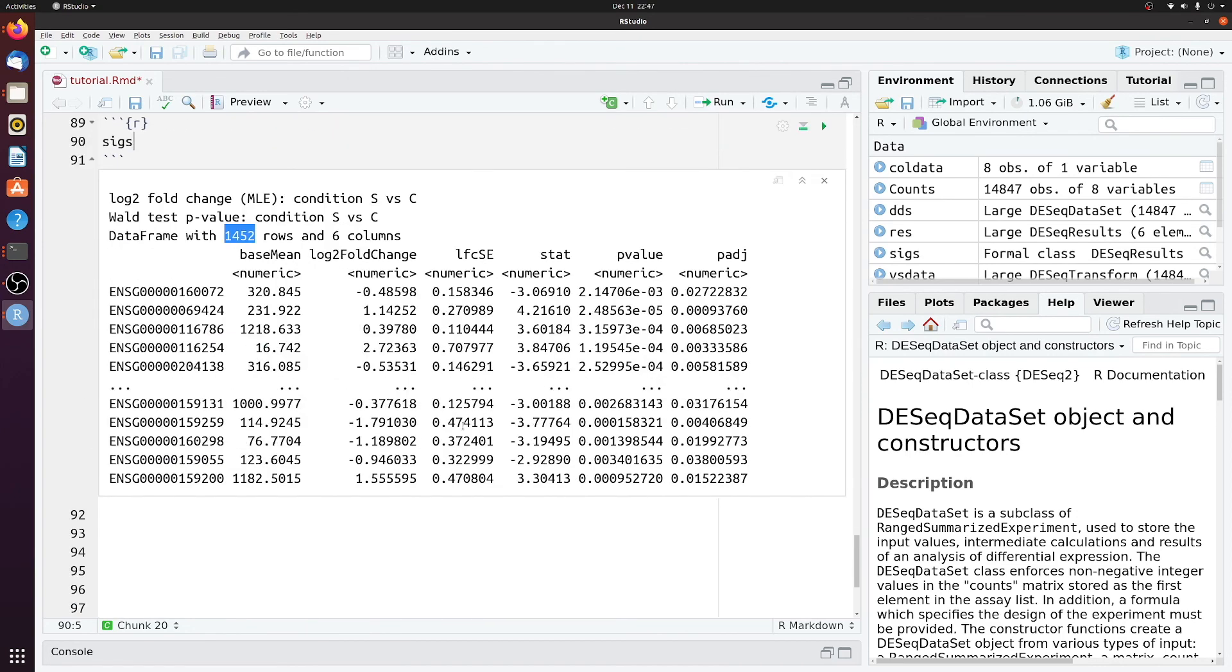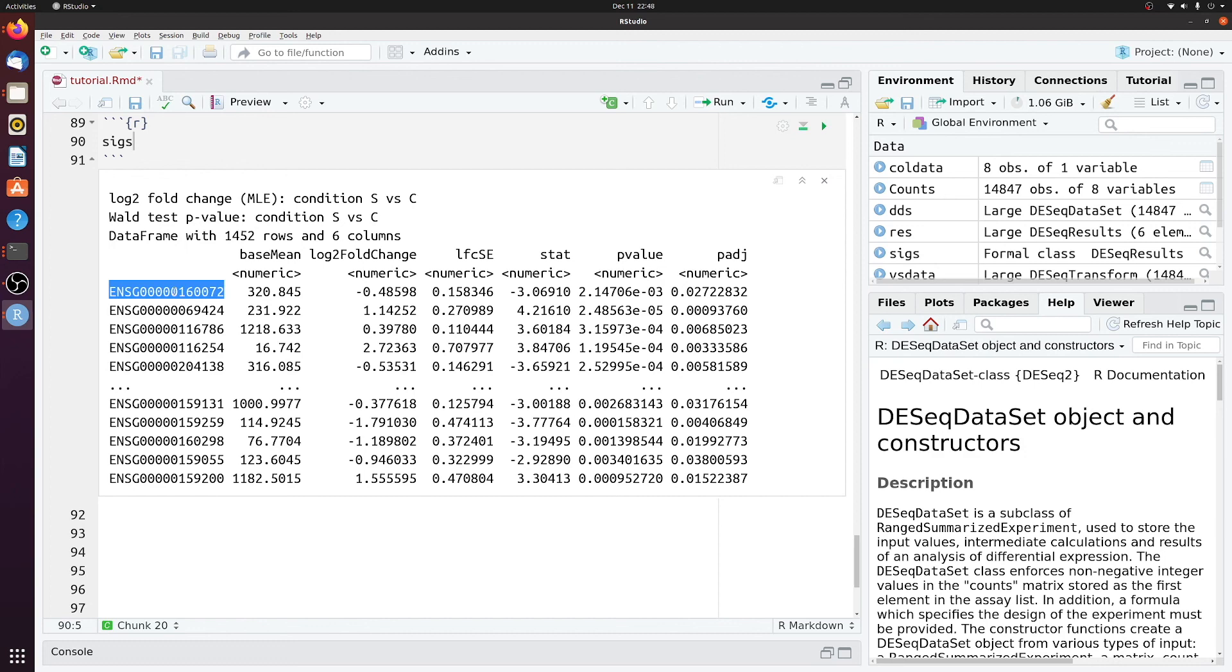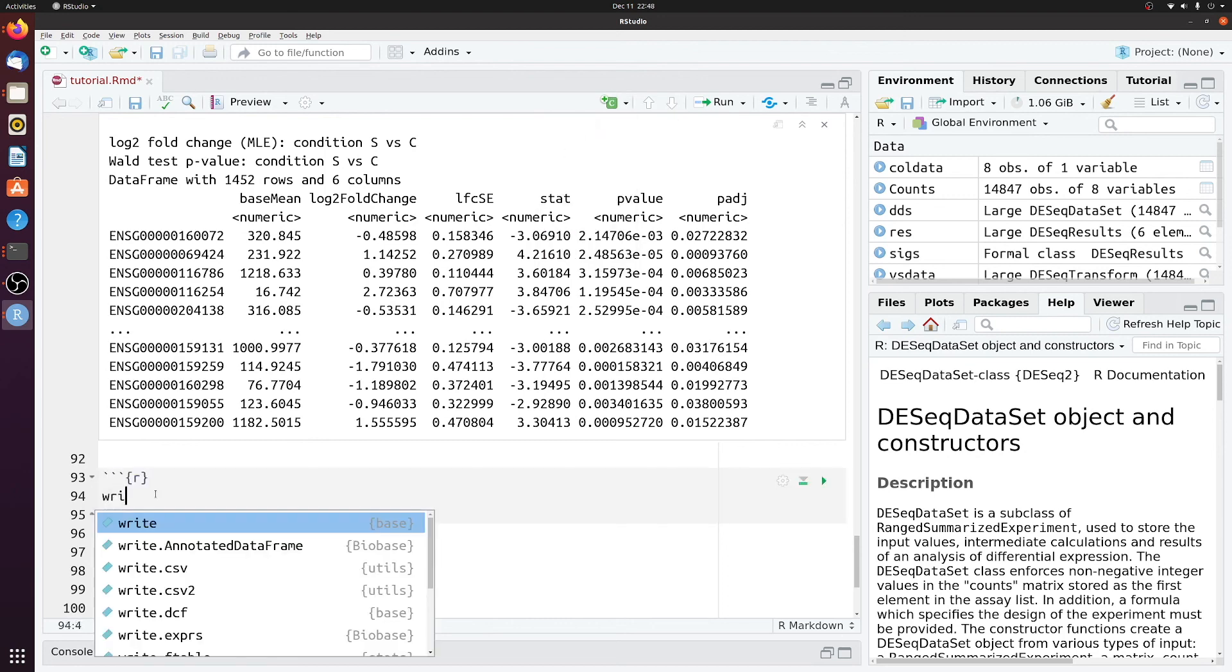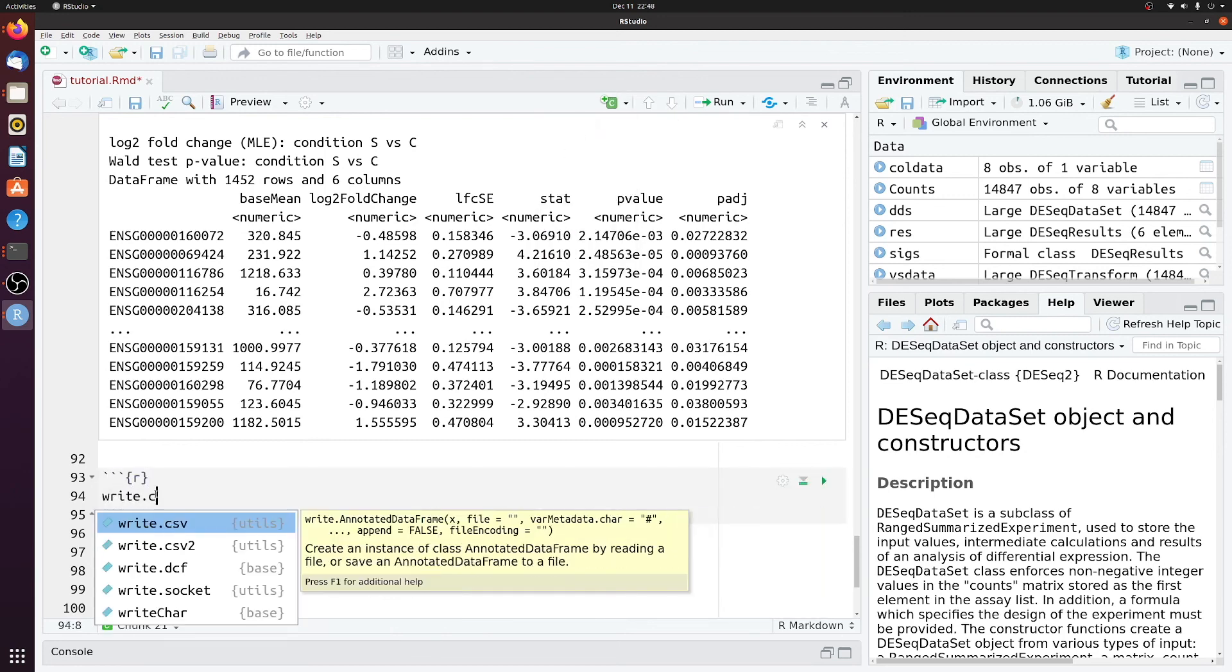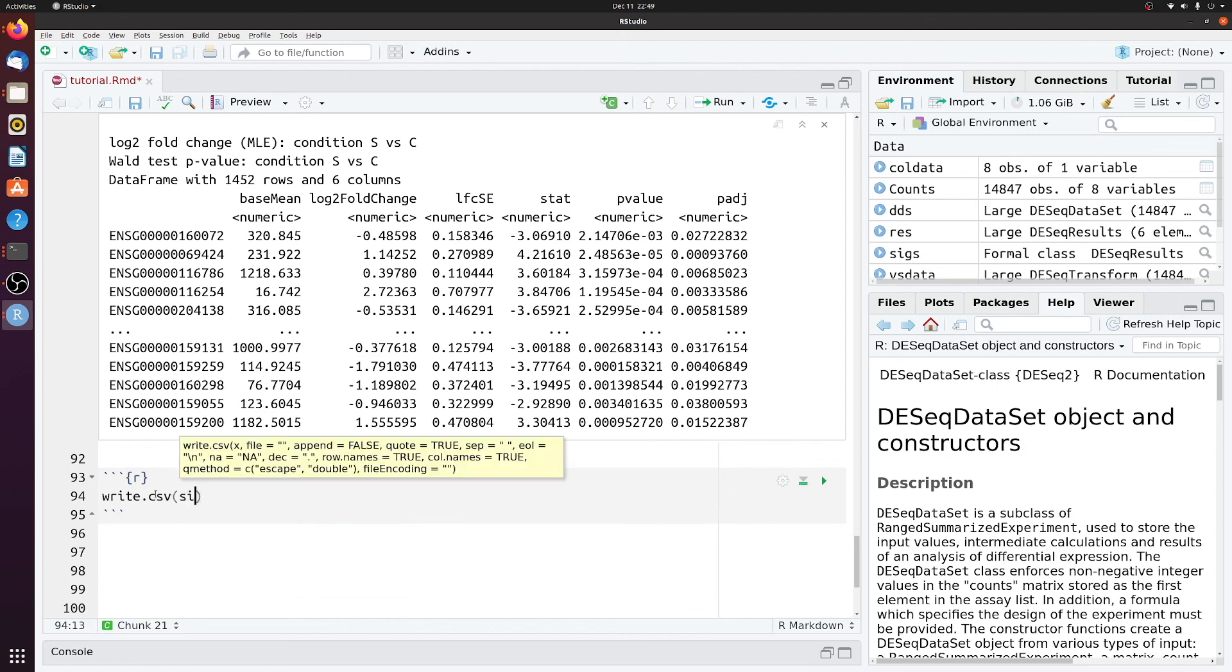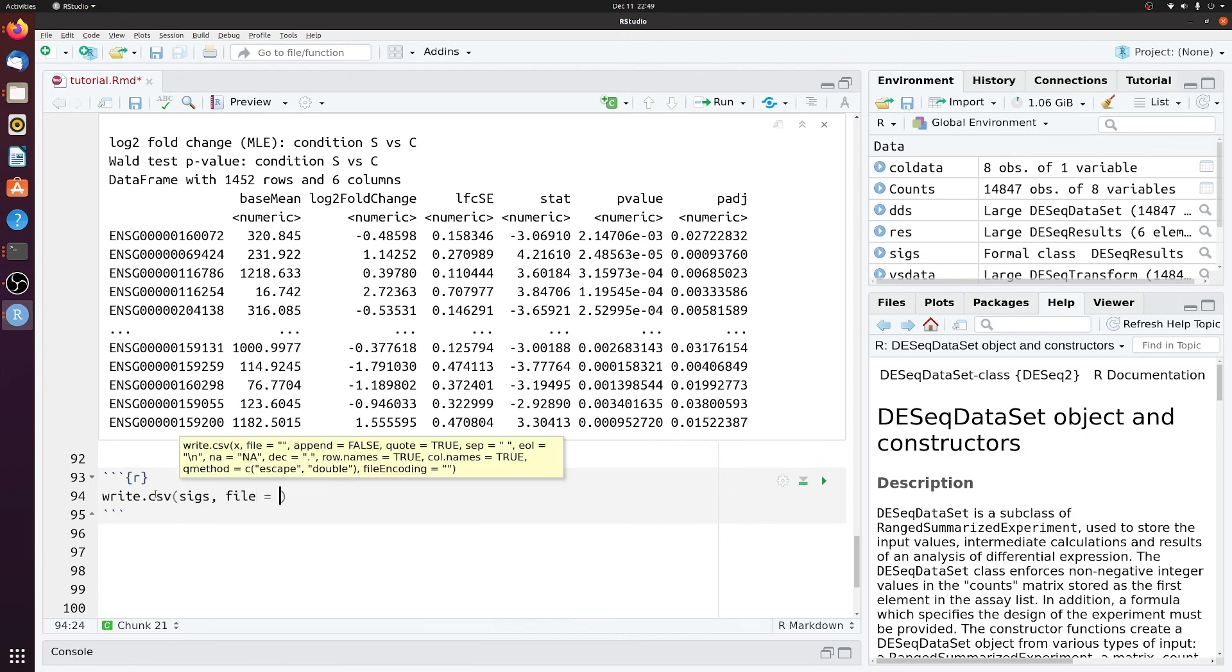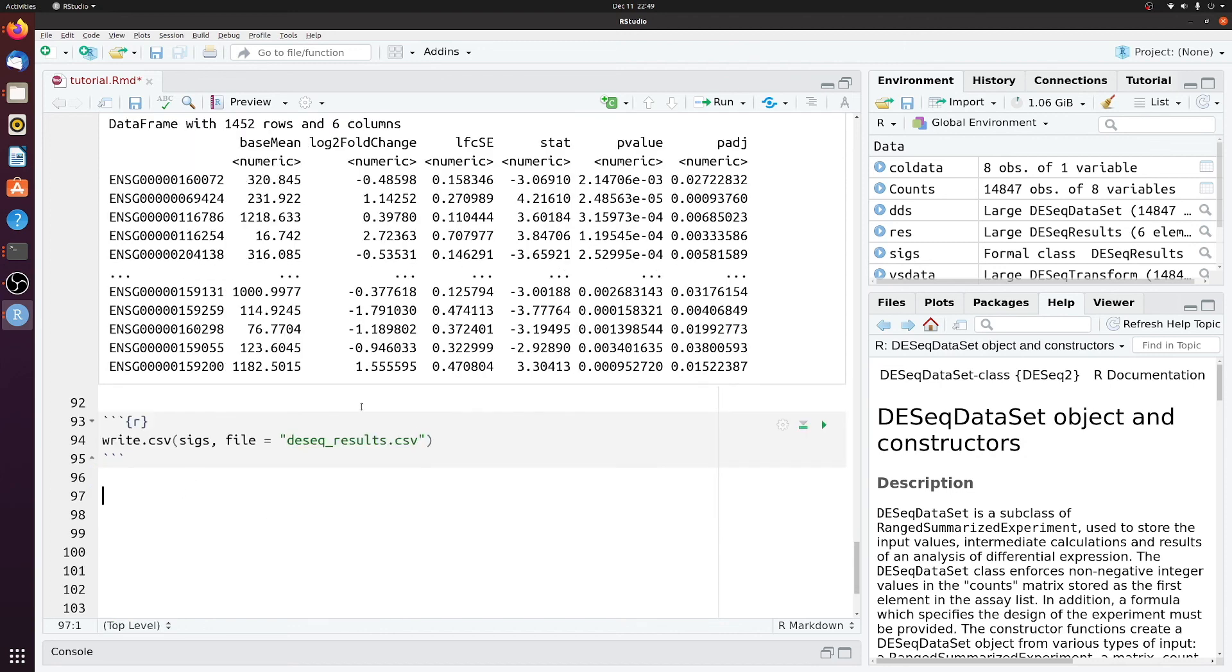So that's basically it for a very simple differential expression analysis. Again, with the caveat that this was very basic, but this should be enough to get you started. In a future video, I might show you how to convert these ensemble IDs to gene symbols. And maybe I'll show some graphing functions, such as a heat map. But for now, let's just save this data to a CSV. So we'll just call write CSV sigs and then the name of the output file. And then we'll just save that in whatever folder you're in.